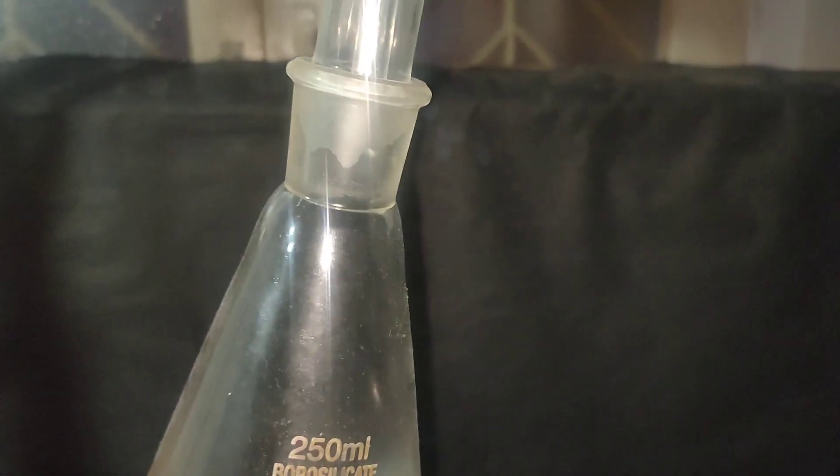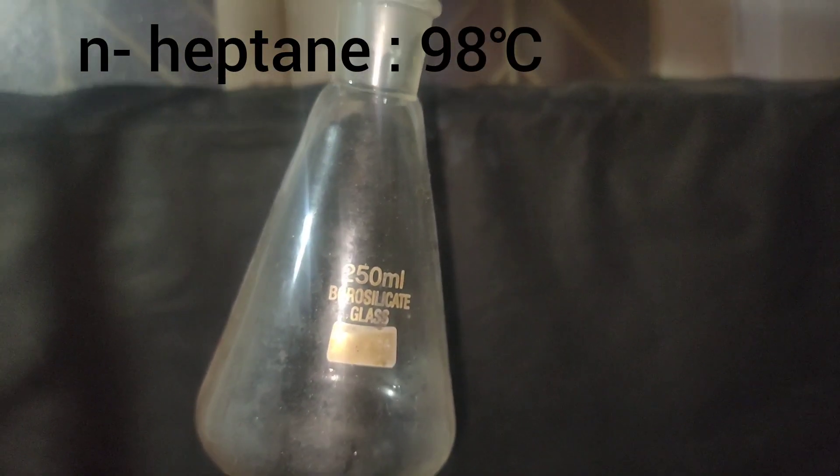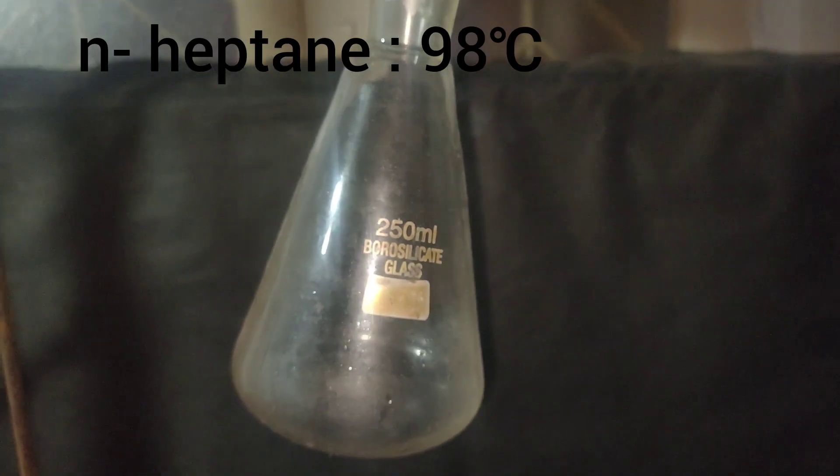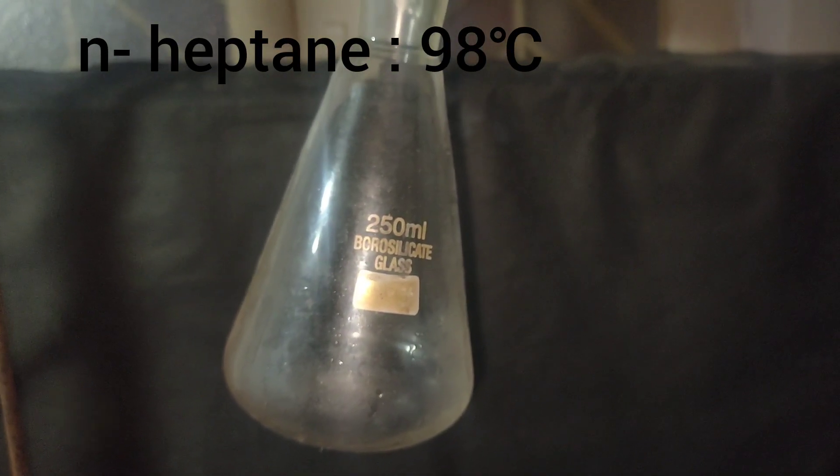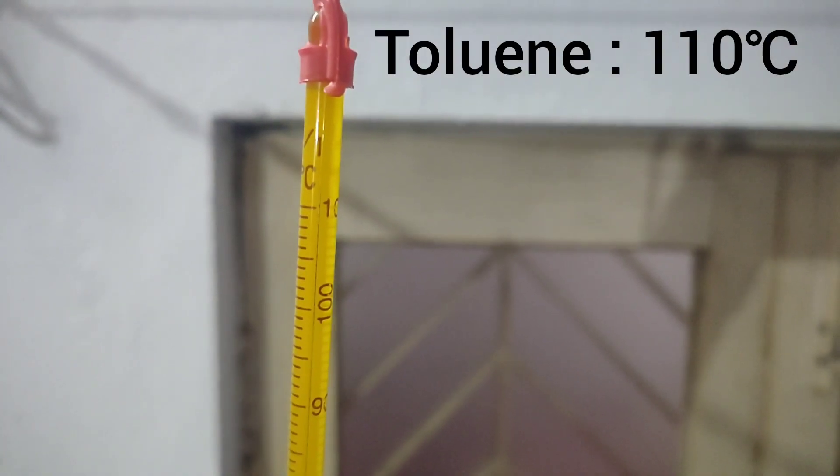Now the temperature went to 90 degree celsius and we started getting distillate in the receiver. However, this distillate consists of heptane and isomers of heptane. And heptane boils at around 98 degree celsius. When the temperature went above 105 degree celsius, I changed the receiver flask.